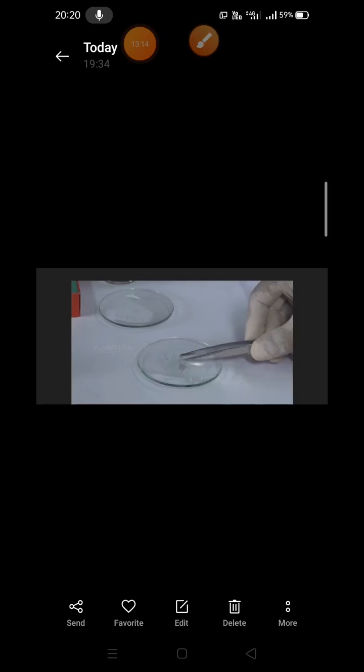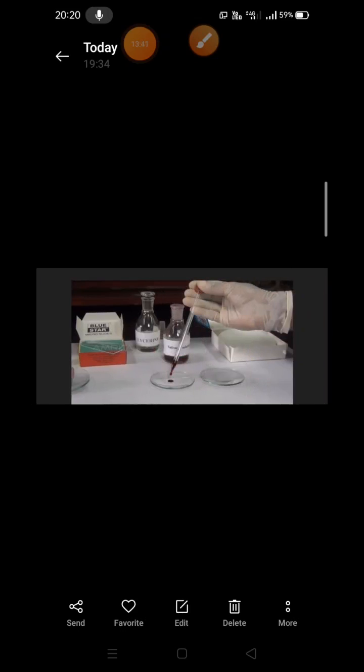in the air. So we will take the watch glass, and water is there, distilled water, and we will transfer that membrane into the distilled water so that it may not dry off, because we have to observe it under the microscope, and it should be straight, it should be wet. Otherwise, if it gets dried, then we will not be able to see the parts of the cell membrane or onion peel. Now next, it is the coloring material, that is safranin.